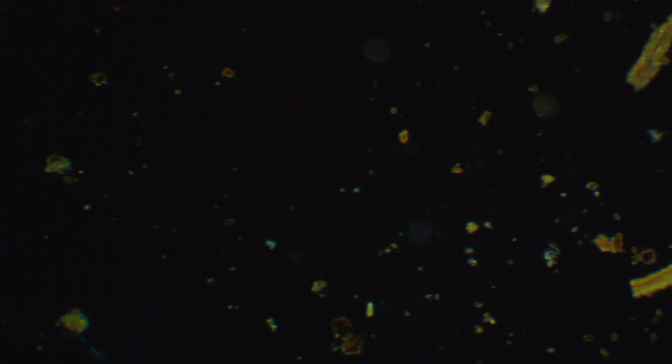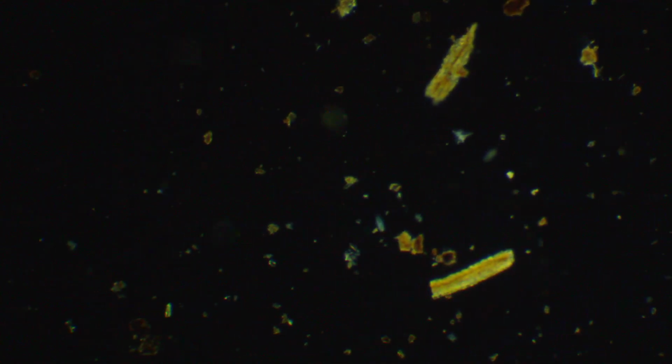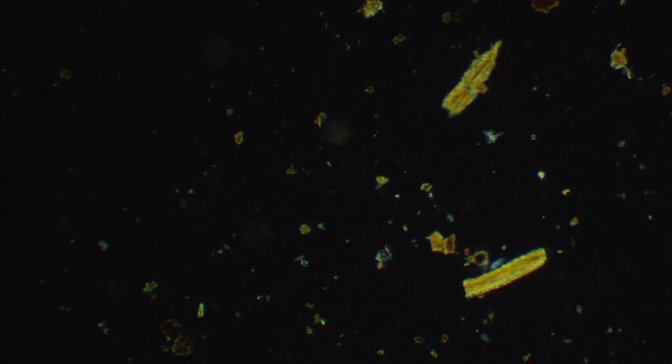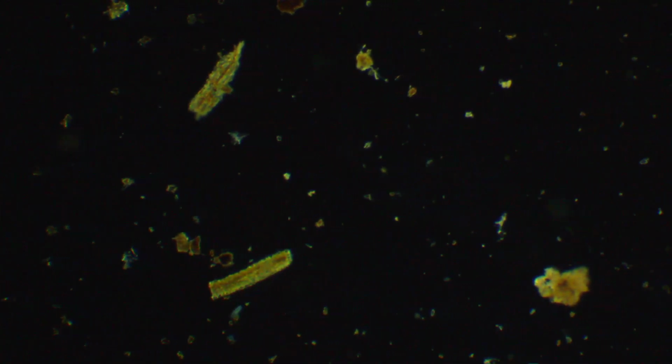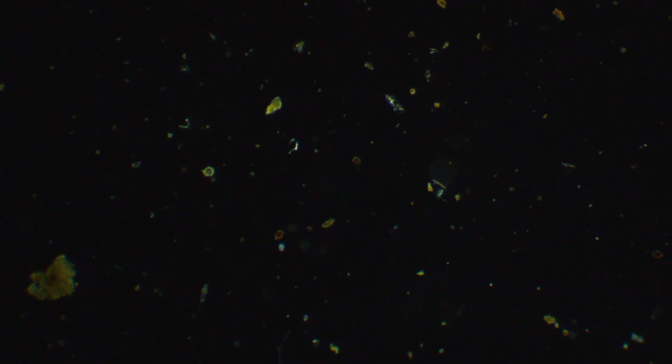So far, nothing. No swimmy things, no little lice things. Oh, there you go. There's one. Swimmy thing and a lice thing, both. There they go. Huh. I thought that one was dead and then he moved. And that's not the only thing you can see that might be actually alive that doesn't look alive. It looks like it was alive, but doesn't move on its own, but could still be alive in some kind of dormant state or something.